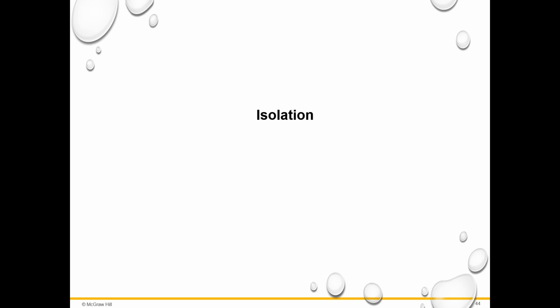In this section, I'm going to talk about isolation, inspection, and identification. So let's start with isolation.